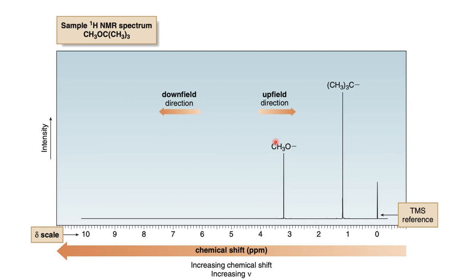The tall peak, which you can see here, appears at 1.2 ppm, which is due to the tertiary butyl group. The small peak is at 3.2 ppm, which is due to the methoxy group. As you can see, the chemical shift is plotted from right to left.